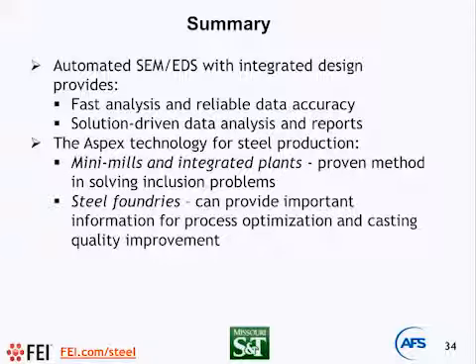I think, like Simon said, different techniques are used for different purposes. And for the sampling of steel from a large ladle or whatever container, the sampling is important. What we've seen in steel mills is that as long as the sampling procedure is consistent, the analysis results are usually repeatable. And that's why this technique has got very wide adoption in steel mills for the improvement of steel cleanliness.